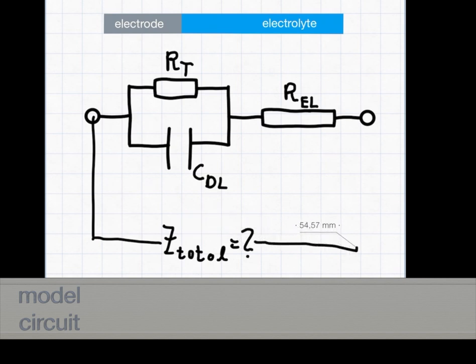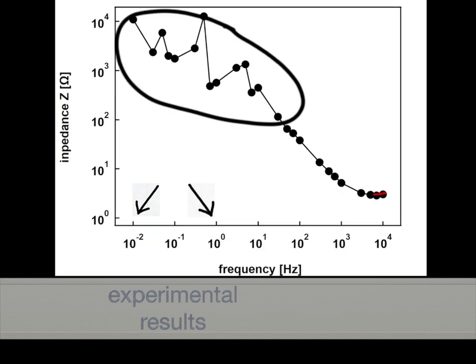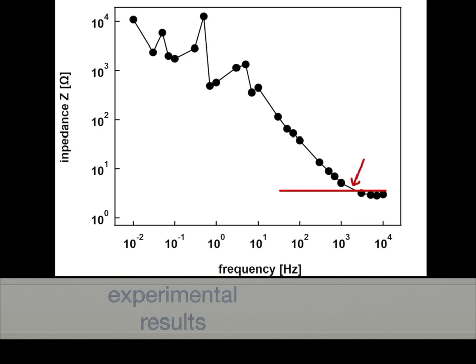When you record your first impedance data, it might happen that your experimental data do not really look nice. Especially in the low frequency range between 0.01 and 1 Hz, you might record data which really spread a bit.